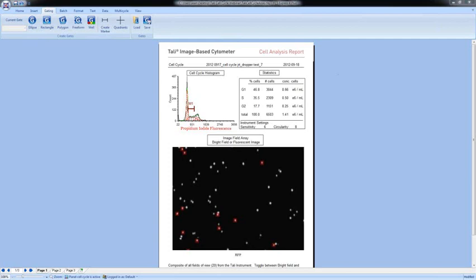One question that came up was why was the G2-G1 ratio actually 1.6 as opposed to being 2? So Shula had mentioned that sometimes when you work with experimental data, depending on the incubation times of dyes, the incubation temperature, the concentrations of dyes, that can change the ratio of G2 to G1. So this time with this particular data set we used 1.6 to help fit the data a little bit better. Again, as your experiments or your assays vary or the variables in those assays change, sometimes you will have to make certain adjustments as the data varies from the theoretical model.